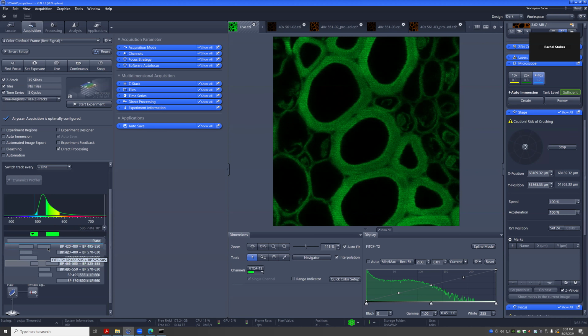Because the second wheel, this is that wheel right in front of the area scan, it'll have a lot of dual bandpass, right? You see two windows of emission that come through. So for example, here, this would be your DAPI GFP combination. If you have this filter in place, you could actually do line scanning with a DAPI and a green. I still wouldn't recommend it as much because DAPI has such a long tail, it'll show up in here. But that option is there.